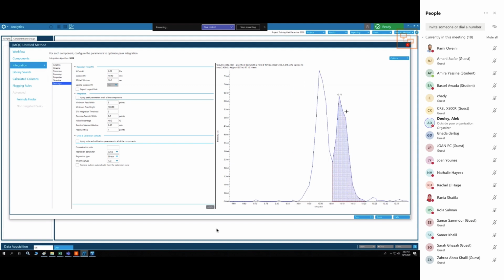So you can also type the expected one if you want. I forced it, I don't have that. Let's try this one first: chromatography, and the second one is distribution. Again, I don't know if it's correct. I just made a random guess. 50% chance I'm wrong, right?